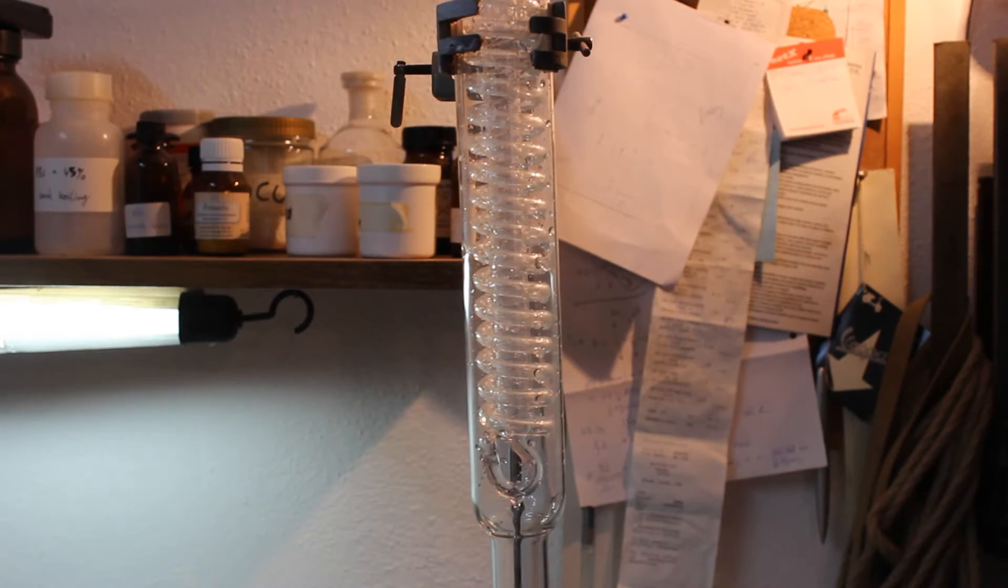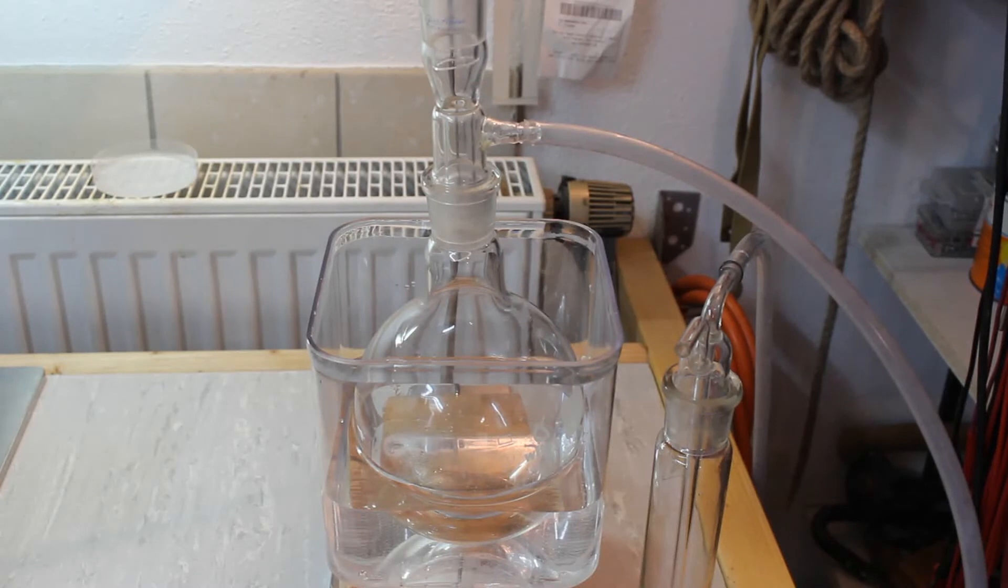On the cold side of the apparatus I have my dimroth cooler. And last but not least we have a vacuum takeoff, our collection flask and a wash bottle containing just a little bit of sulfuric acid. And this serves to trap any ether vapors that want to escape.